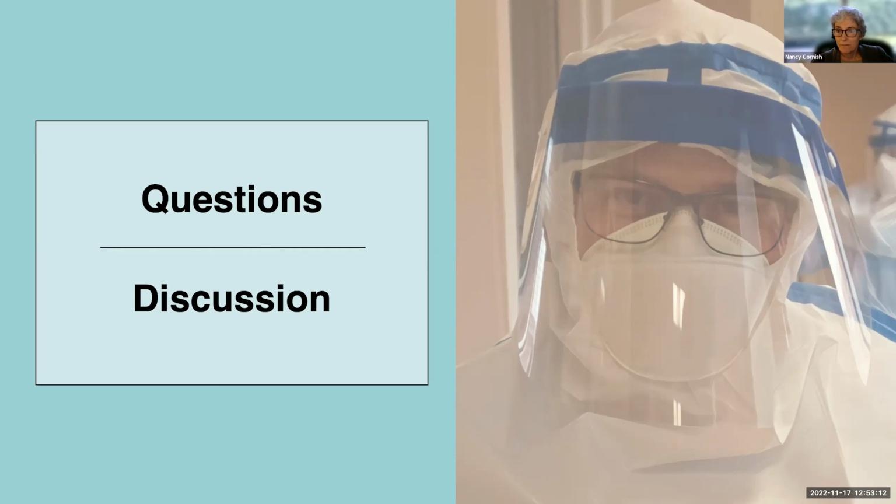Vicki, go ahead. Yeah, I'm helping to think these through, and this obviously is an extremely complicated question because of the broad scope of manufacturers and types of designs of instruments. But I don't want this question to come across as snarky. That's not the intention, but it's more of a thought experiment. Do you do this after you have an HIV positive patient, or somebody dies of some horrible encephalitis of unknown etiology? Do you clean your machines? Do you think about it? So again, this is kind of the fear factor taking over a little bit.